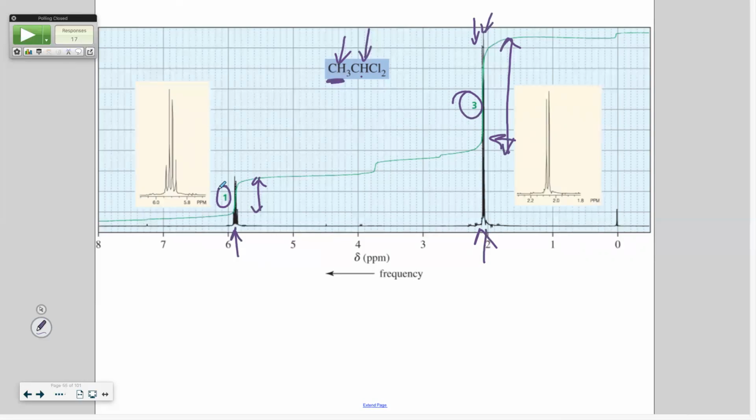Okay, what is this little junk? I don't know. This one is from the chloroform. This looks like something was in their sample. They publish this in the book and they don't even get a good sample. But I think part of that is so that you see that you can have a little bit of trash in there. If you have trash in your samples, a couple things to look for would be to see if there's acetone in there from cleaning the tube prior to using it.